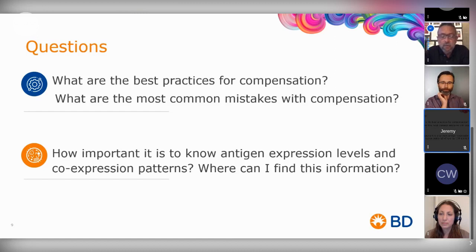But I think one of the important things is when we go into the inside of a cell, the quantitation technologies don't work as well. And they don't work as well because we have to fix and perm our cells. And when we do that, we cross-link the proteins inside, and that is impacted by time and temperature and many, many different types of variables. So trying to get a real accurate count of the actual epitopes inside a cell for a protein is actually quite difficult.